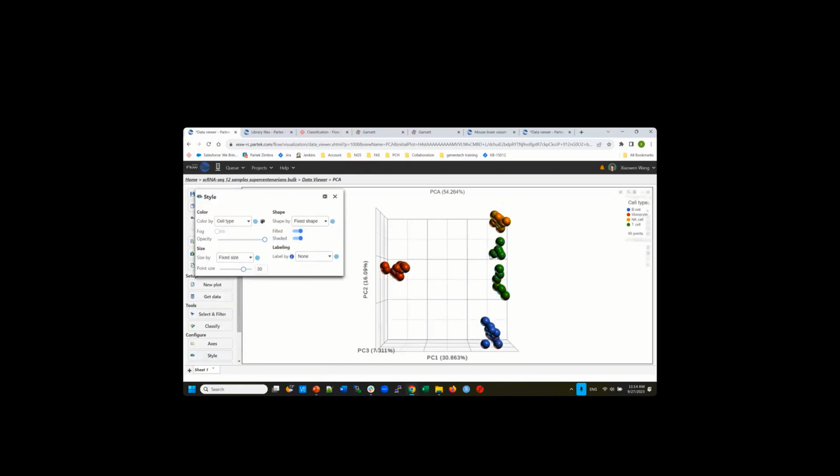So cell type is the biggest variation. That's the whole point of single cell analysis, because different cell types are very different, the biggest source of variation. And over here, monocyte is very different. It separates the most on the first PC, and all the others are separated on the second PC, right?